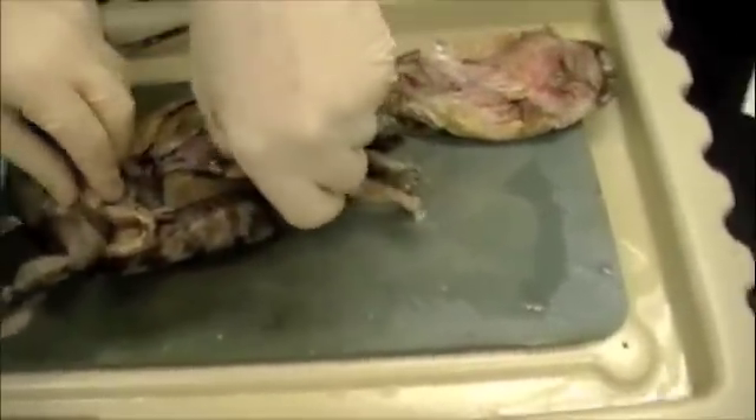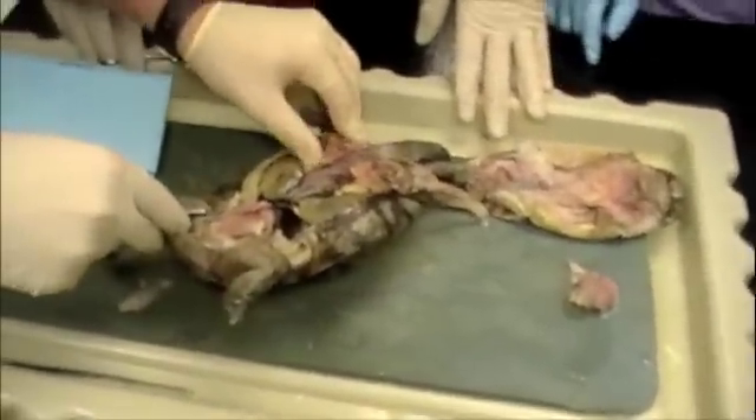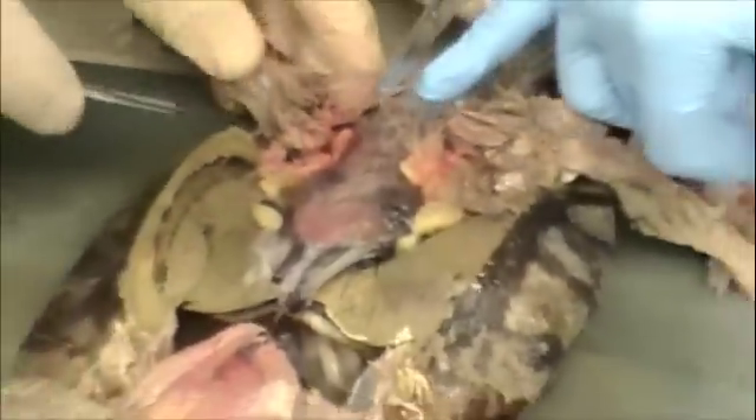I wonder what all that is. Long shot. Where are the lungs? I need to get this piece off here. That's the lung shot. Oh, that's the trachea.